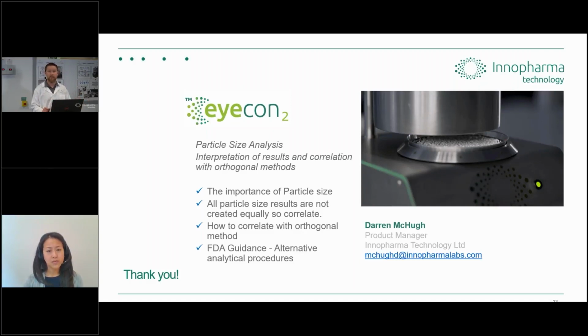So we have various options. The unit comes as standard, let's say, with a laptop, but if it was to be installed inline, we would work with the automation engineers or the IT department to implement it onto their pre-existing HMIs.